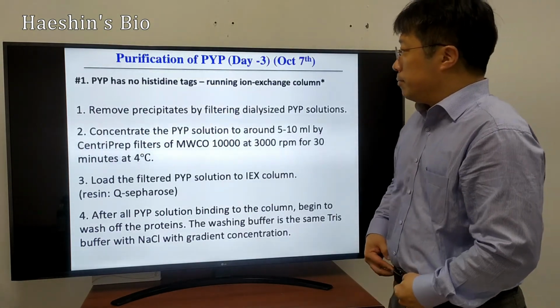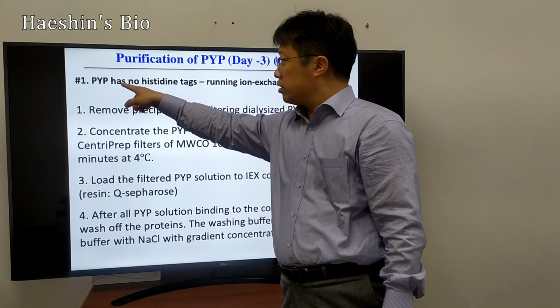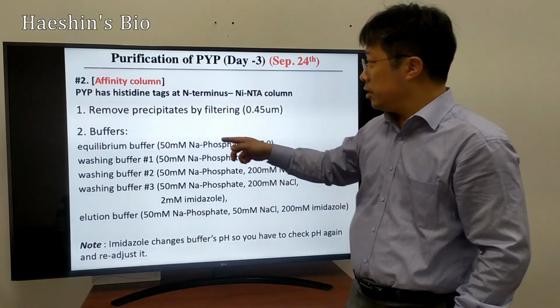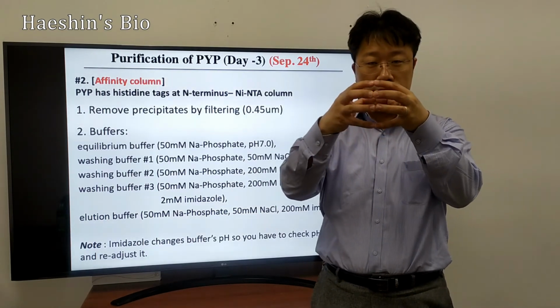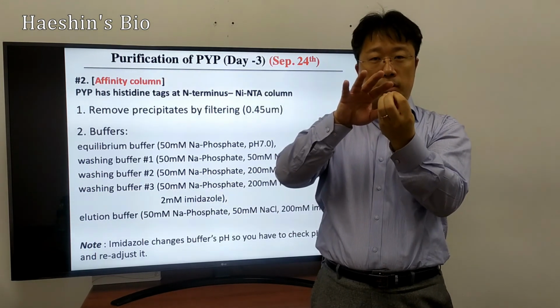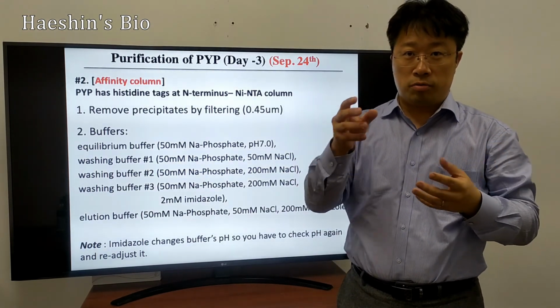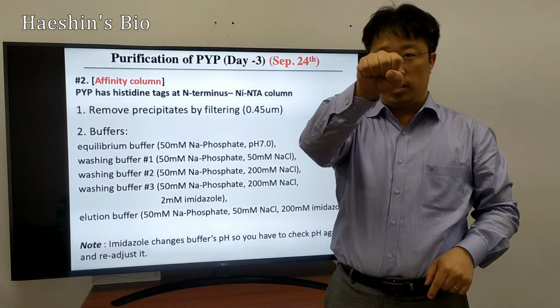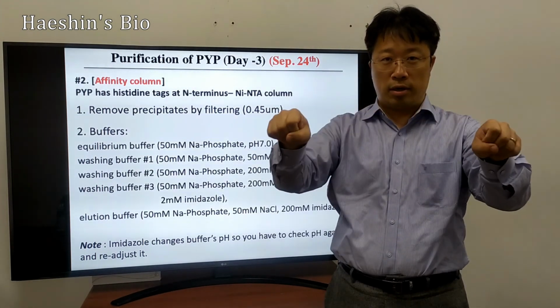So now is this PYP purifying. This is an ion exchange column. So this has no histidine tag cases. Later on, you have another step, which is the histidine tag purification. So this is the separating two directions. So that you have now a salting out product, which is a fairly already purified protein solution of the highly soluble proteins, including the target protein. But there are other proteins there also. But there will be a without histidine tag pathway or a with histidine tag pathway. We have 2 different pathways, I will explain.